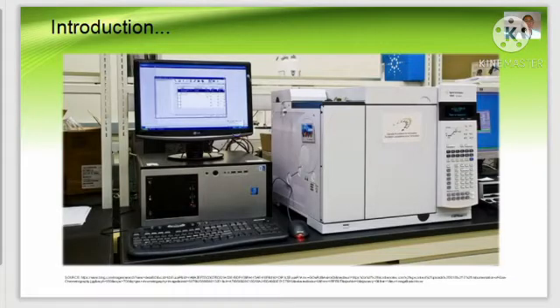So, chromatography is an analytical technique used to separate and analyze samples that can be vaporized without thermal decomposition. Sometimes, gas chromatography is known as gas liquid partition chromatography or vapor phase chromatography. Technically, gas liquid partition chromatography is the most correct term, since the separation of components in this type of chromatography relies on differences in behavior between a flowing mobile gas phase and a stationary liquid phase.